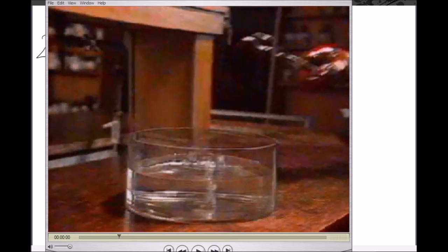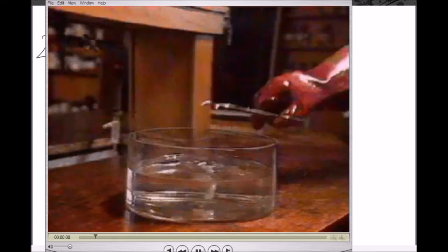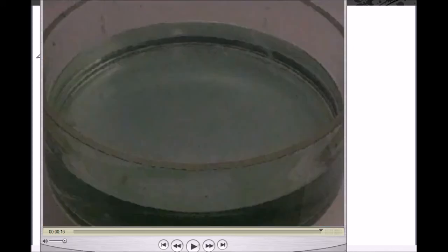You can see the bubbles there quite clearly, and it's those bubbles being made in such a small volume in such an enclosed space that causes the bowl to explode. The amount of gas being produced really quickly at high temperatures causes the gases to expand, and the bowl then just blows up. So we'll play that one more time. Okay, so you can see it blows up from the bottom down because the metal has sunk this time. Okay, so we'll just shut that down.